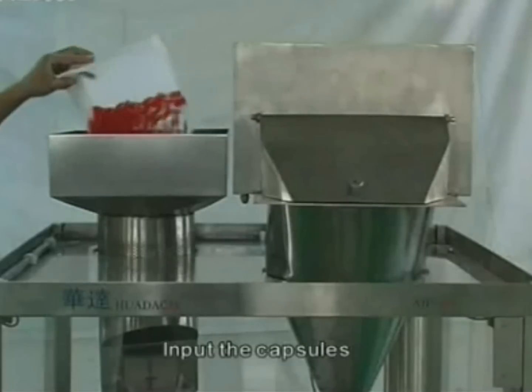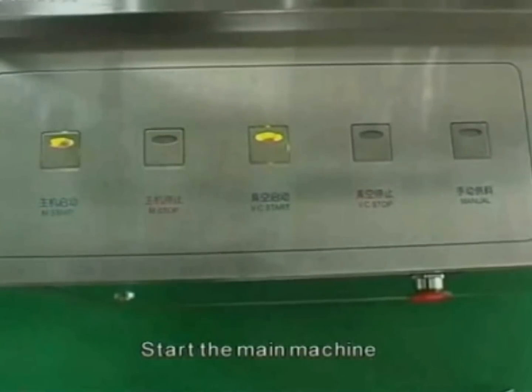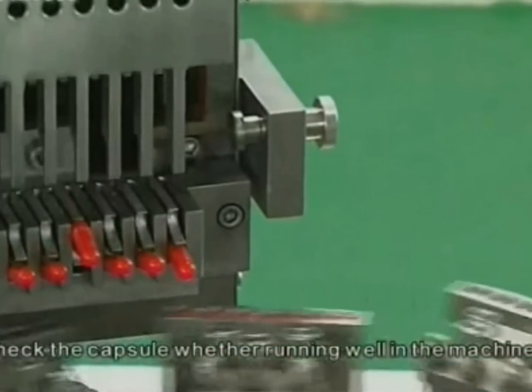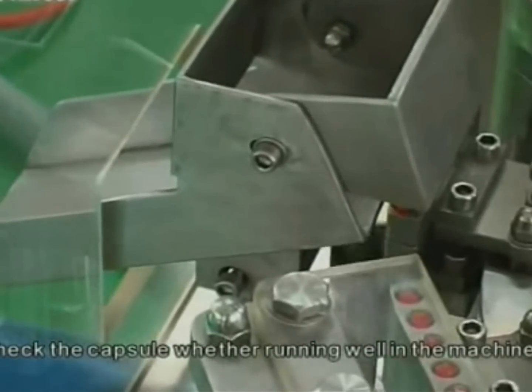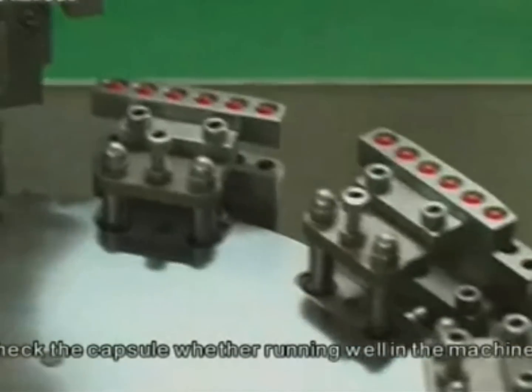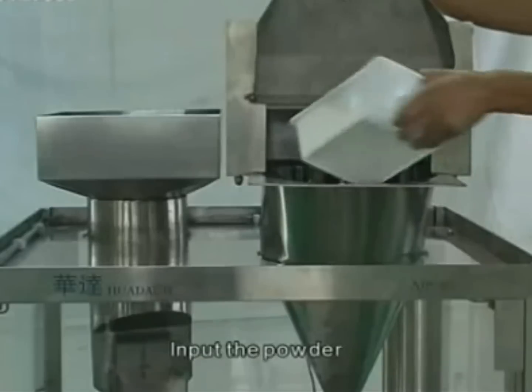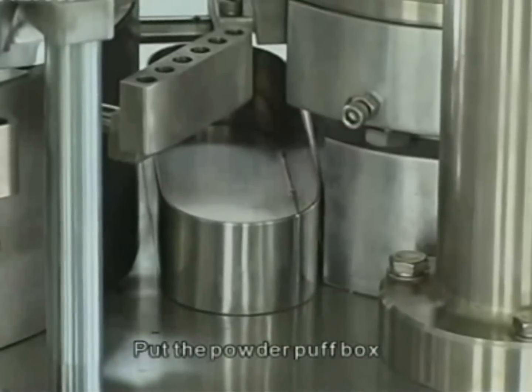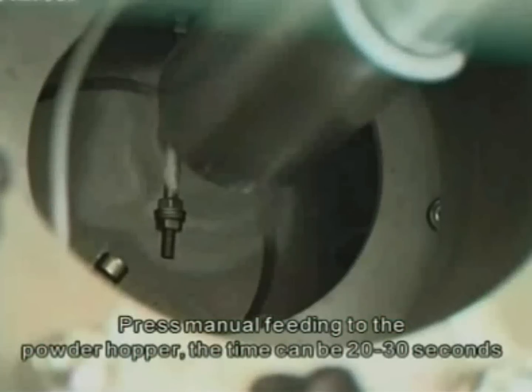Input the capsules. Start the vacuum pump and start the main machine. Push out the capsule location push rod and check whether the capsules are running well in the machine. Input the powder; put the powder puff box and press menu feeding to powder hopper. The feeding time can be twenty to thirty seconds.